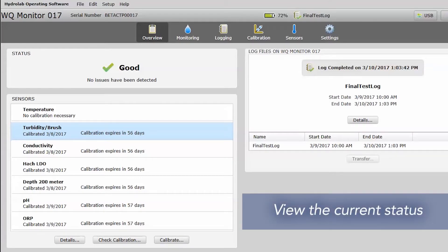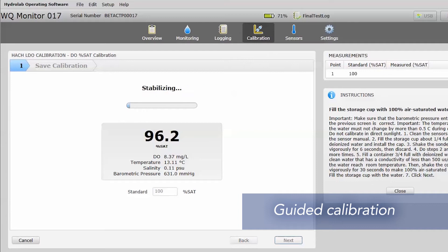With the HydroLab operating software, quickly view the current status of the instrument to ensure it's working properly. Maximize uptime with guided calibration tasks and routines.